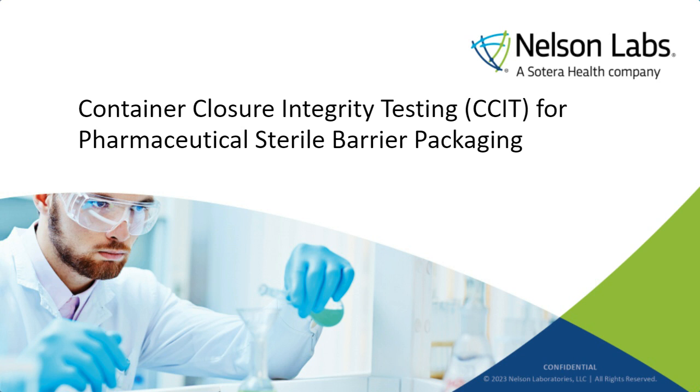Over the next 45 minutes or so, Jennifer is going to review all the common CCIT methods found in USP 1207 to compare the testing options, and she'll also explore CCIT method validation approaches and pitfalls to enhance understanding of how methods can be applied to different sample types.